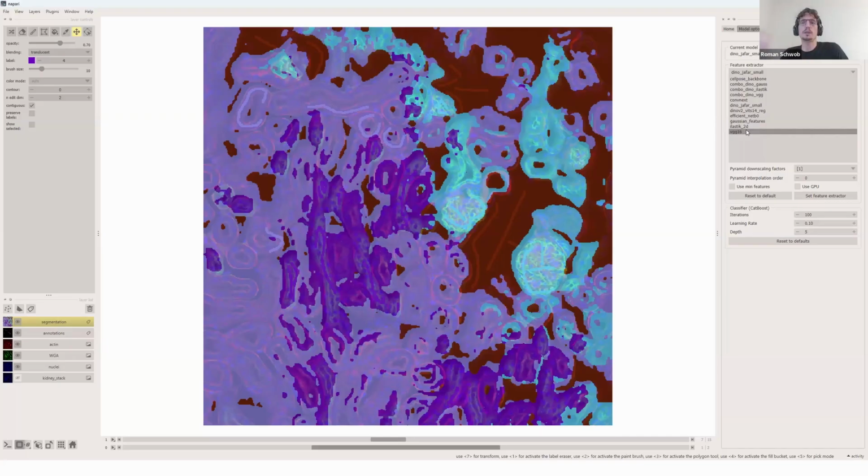So it's really helpful if you can choose between different models and use their strengths in one single framework, get used to the usability of Convpaint, and then apply it to different state-of-the-art models that really suit your task and your goal, right?